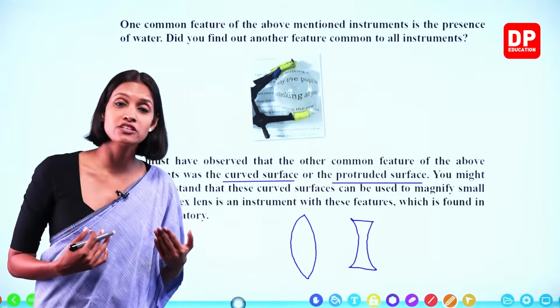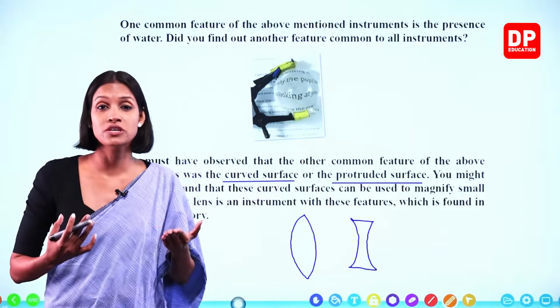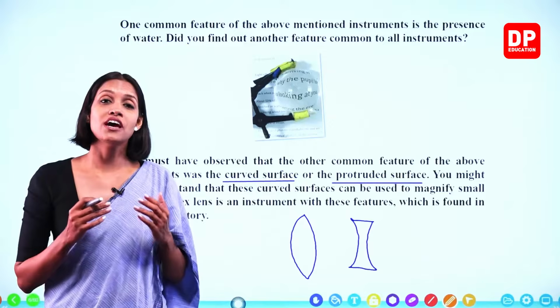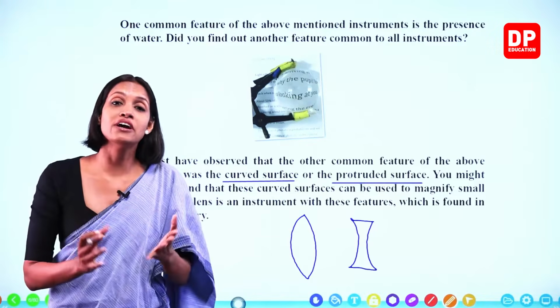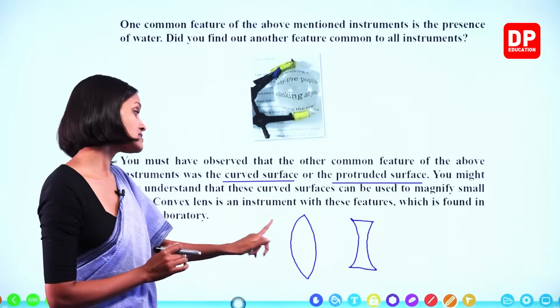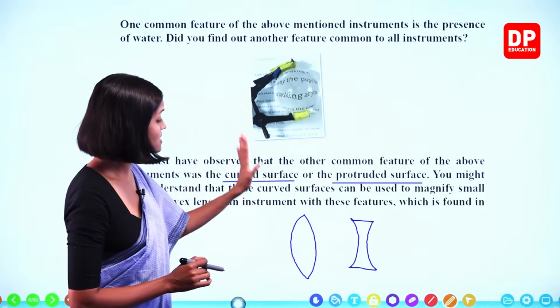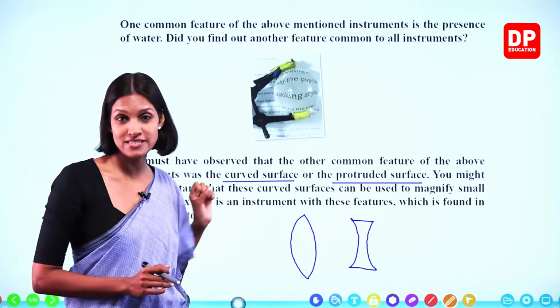When we use microscopes to magnify objects, we look through them and see a bigger image of the objects. So in that case, we have to use a proper lens which we can use to magnify the objects. This is the perfect lens. Therefore, under this lesson, we are going to pay attention to these convex surfaces or convex lenses, okay?